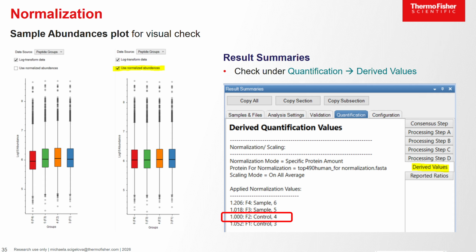You don't want that, because if you have a problem with your sample, normalization will not fix it. For the precursor-based quantitation, for instance label-free quantitation, a big change means that some of the samples must have been loaded in much smaller amount, which means that a lot of peptides might not be detected simply because they were below the level of detection, and not because they were absent in the sample which was loaded in lower amount.